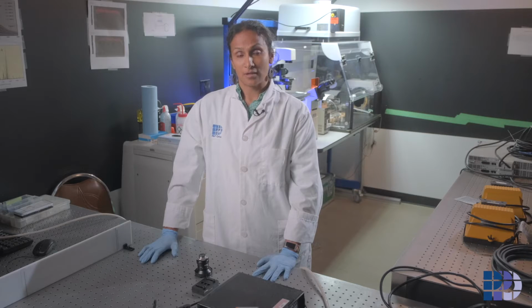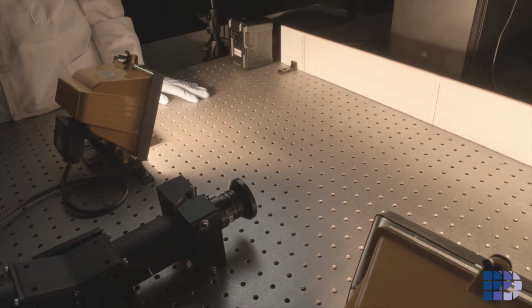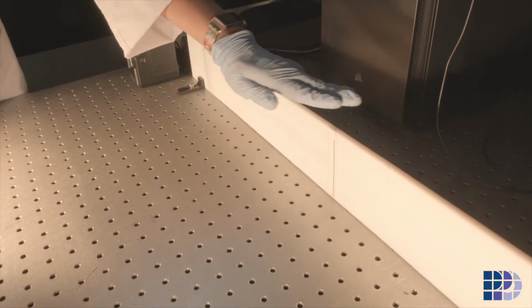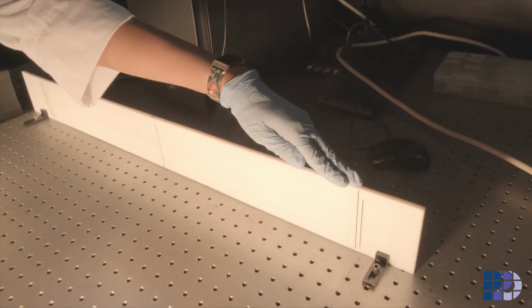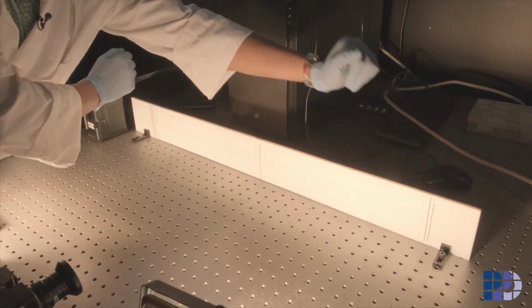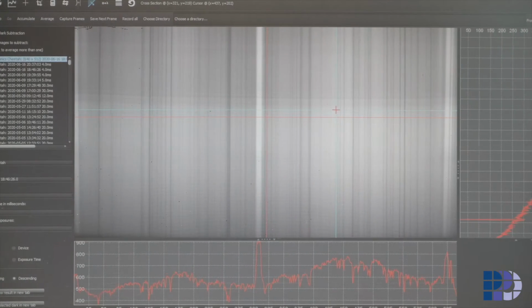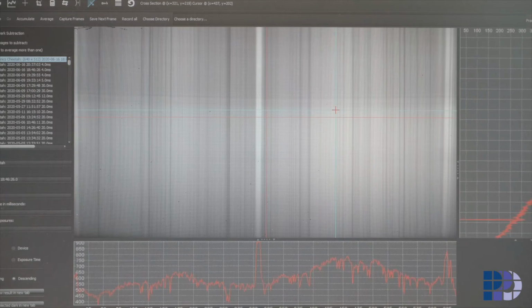Now that the spectral calibration is complete, we are going to adjust the spectrometer for its field of view. Now you can see there is an external lens to the spectrometer and it is placed at a distance from a target to mimic the PPO smart imaging system. The dark lines indicate the range within which I want the spectrometer to work, and with the halogen lights on, I'm going to again move the lenses. By doing this, I'm changing its magnification. I can see that the spectrometer is within the acceptable field of view and also in focus.